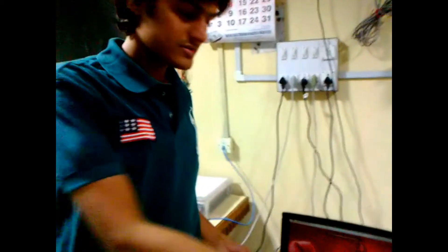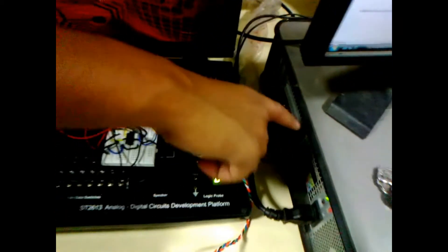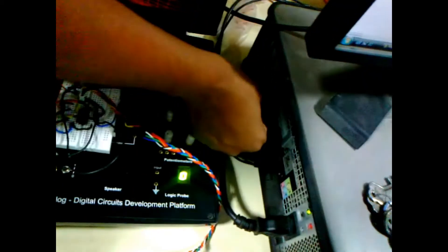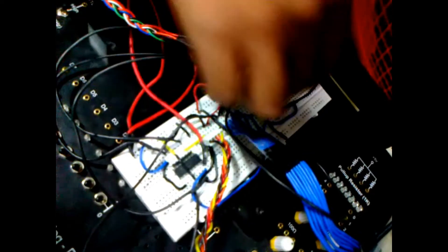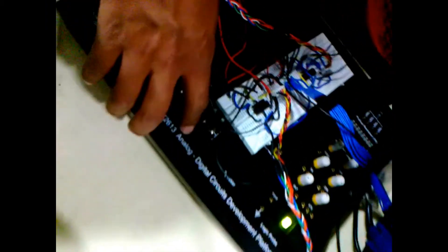You can see here a sub-VI for the stepper motor for the beaker and a sub-VI for the stepper motor for the robot arm. This is the whole program. The interface is done with the parallel port from the CPU — you can see the parallel port at the back of the CPU. We have interfaced it, and from that we have taken eight data outputs on the breadboard. These two are the stepper motor driver ICs. This is a power supply and another digital board.